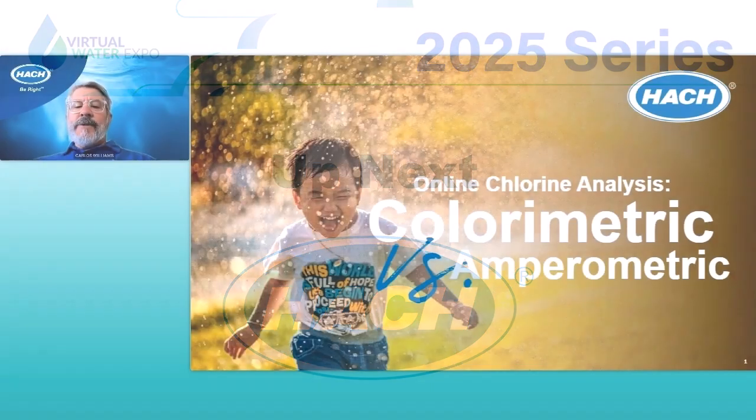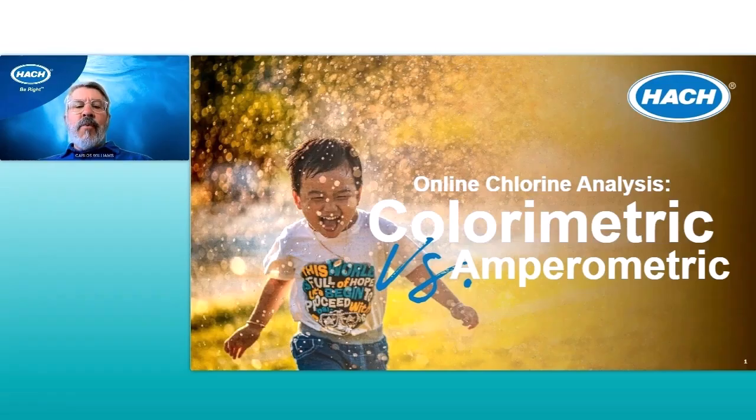Thanks for the intro, Travis. Appreciate it. So we are going to talk about online chlorine analysis and some of the differences between the two main styles of chlorine analysis, colorimetric and amperometric analysis.